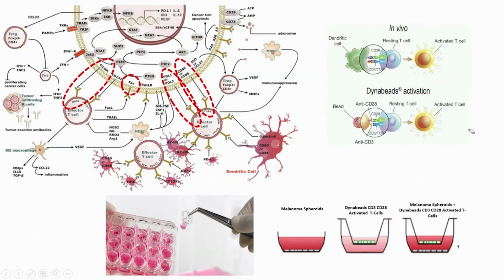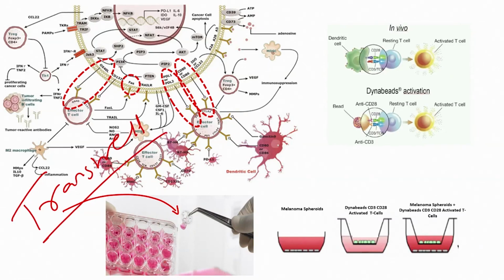Now, let us come here. This image that you can see here is called a transwell. Transwell, T-R-A-N-S-W-E-L-L.